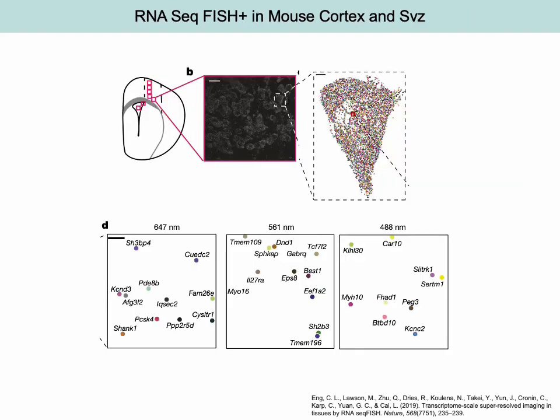And the next figure shows that RNA SeqFISH could be applied at the tissue level. In here is the mouse cortex.